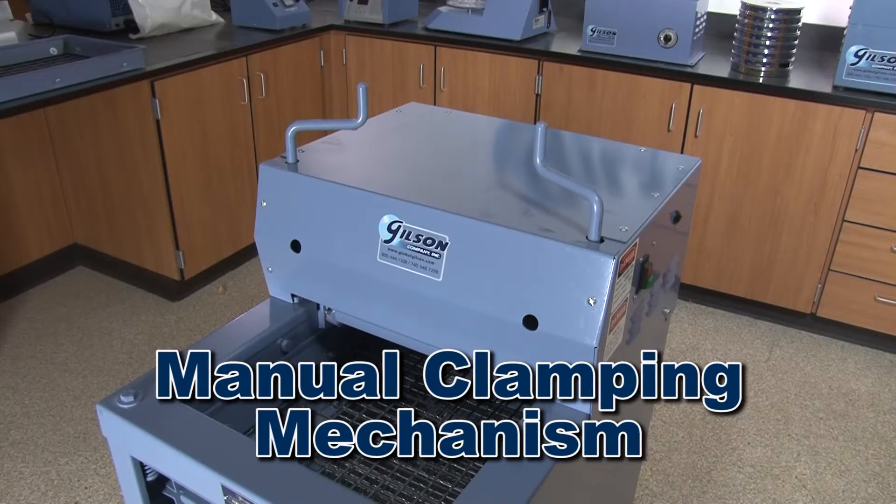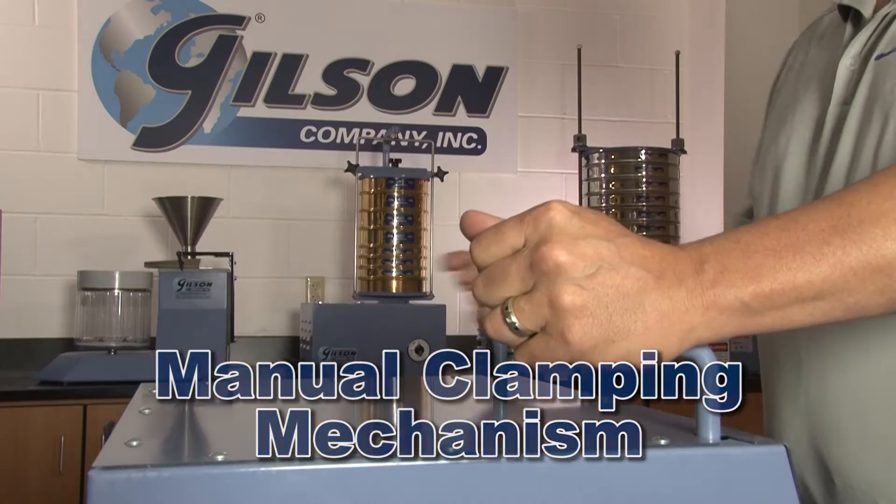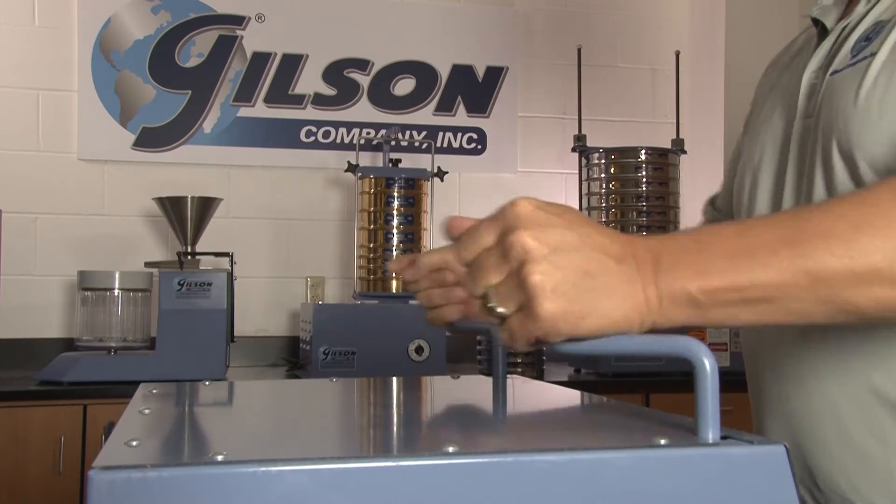The TS2 has a mechanical clamping mechanism which secures screen trays with a few rotations of the dual clamping rods.